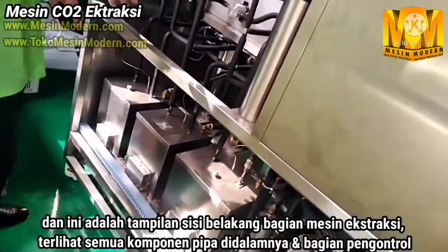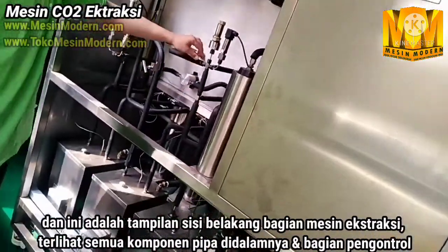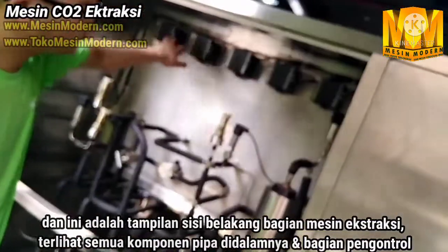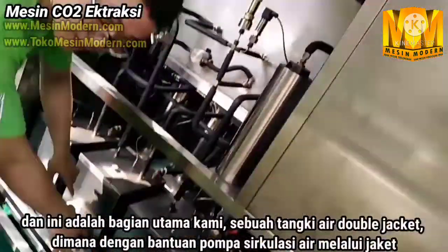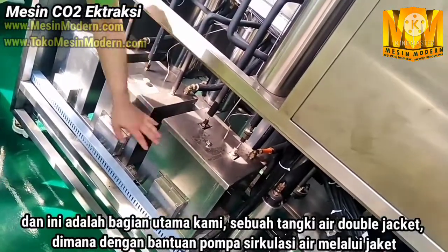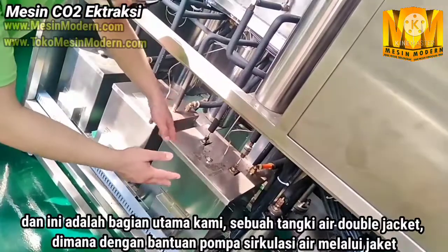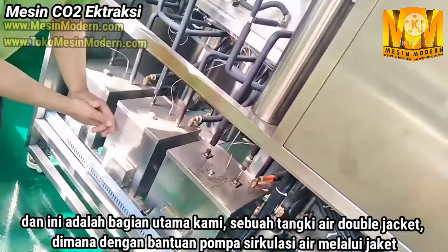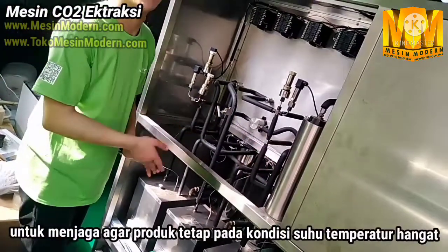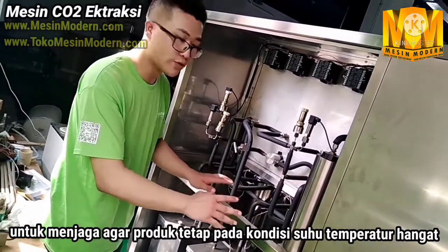Here is the back side of the machine. You can see the pipelines, and also the back side of the controllers. And here is a main part — the water tank. We call it a water box. The water is inside, and with the help of a water circulation pump, the water will circulate through the jacket of the vessels.